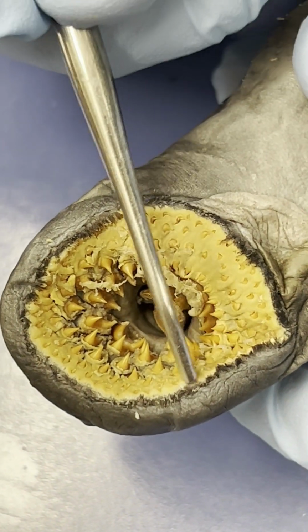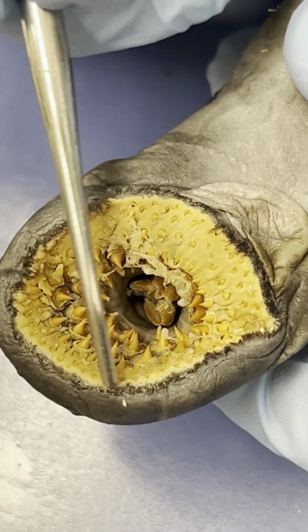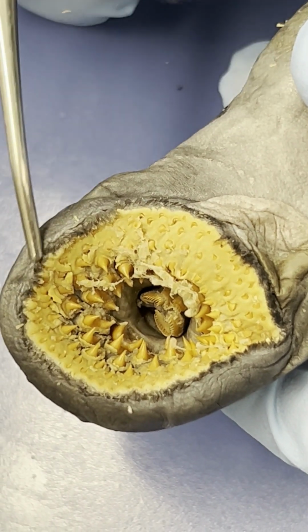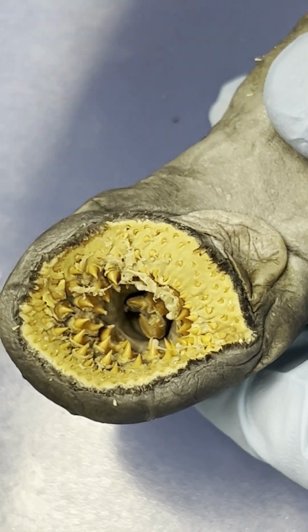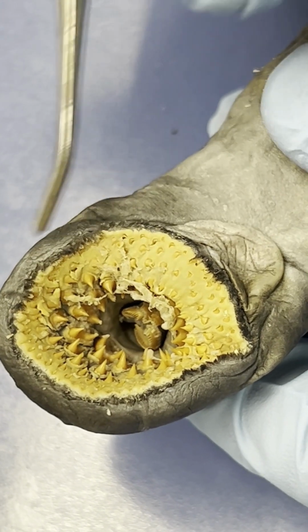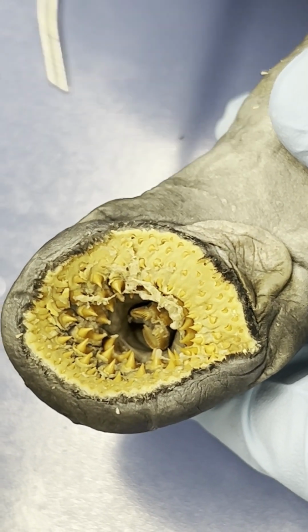But all along here are minute papillae that are around the animal's mouth. And they're designed for a few things. One of them is to actually detect different micro vibrations in the water, but also to help the animal latch on to the host fish or the rock that it's going to filter feed on.